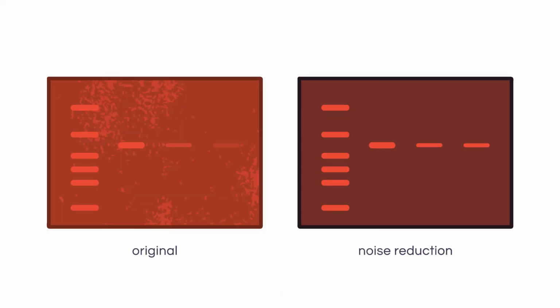I started this course describing the difference between image adjustment and manipulation. This is an important distinction because we strive to accurately represent the phenomena that we are studying through the visual display of our data. For example, if you choose to reduce the noise on your image, the software will adjust the pixels and could potentially change the entire band. This type of change to your image is an example of manipulation because you're making specific changes to your image instead of uniformly adjusting the entire image.